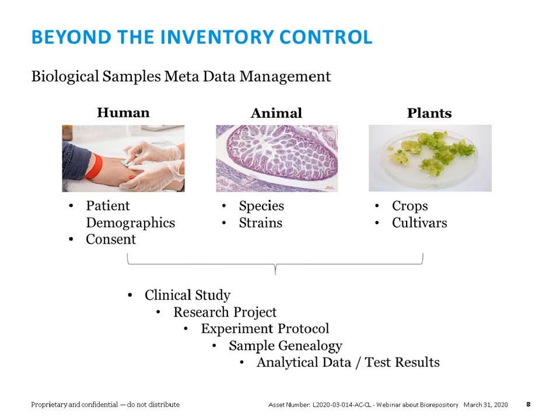And knowing all of this data is really important, because at the end there is going to be all of this data aggregated. It's coming from some kind of clinical study or research project, or perhaps it's associated to an experiment, and that experiment has a protocol on what tasks are going to be applied to the different samples. And having all of this metadata is going to be very important.